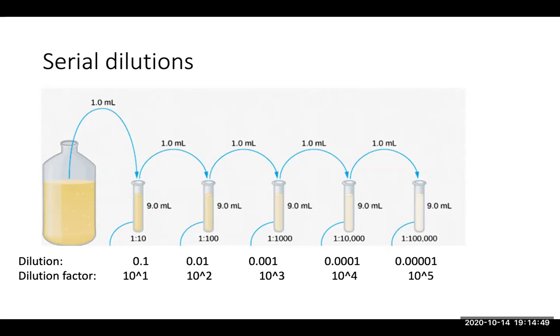And they would just section off the plate into quadrants and do one quadrant and then multiply by 4. So there are some different strategies, and in this simulation, they are not going to make you count more than 100. You won't even need to count that high. I think 54 might be about the highest that you ended up counting in the lab, so don't panic.